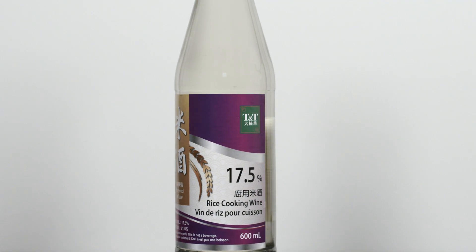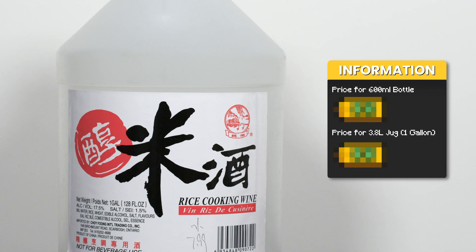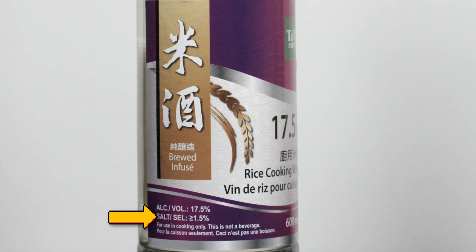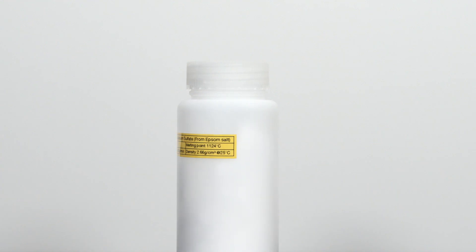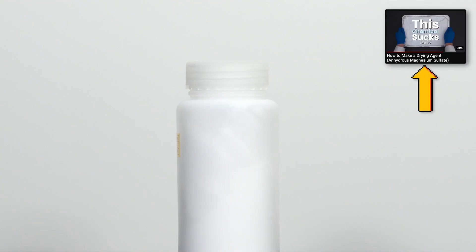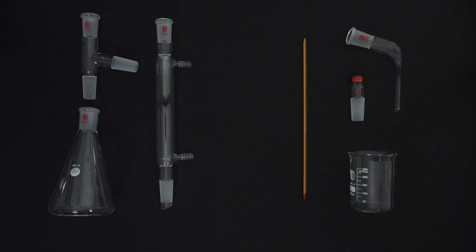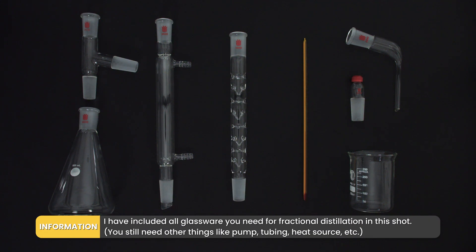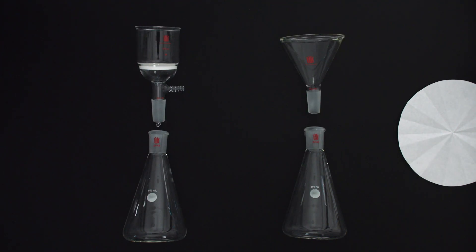Let's go over the materials needed for this experiment. Firstly, you will need cooking wine — the one I am using is salted cooking wine bought at a local supermarket, with the highest ethanol content I can get at around 17.5%. As for why it is salted, I will explain in a bit. Secondly, you will need a drying agent to dry ethanol from 95% to 100%, which I made in my last video. I will also include a few other options later. Thirdly, you will need a fractional distillation setup — a simple distillation setup won't work for distilling ethanol efficiently. Lastly, you will need a filtration setup for the drying part.